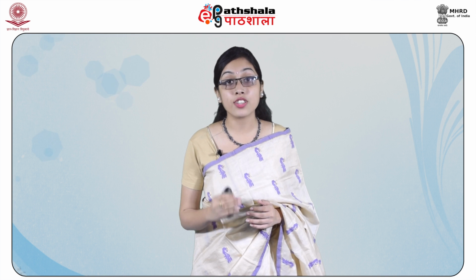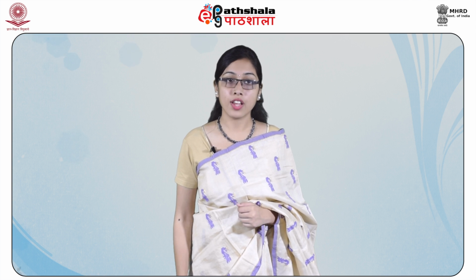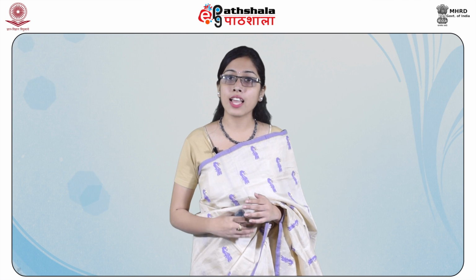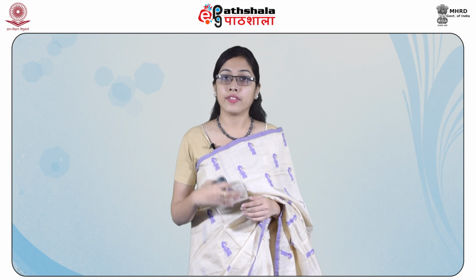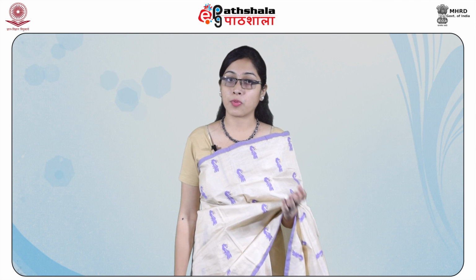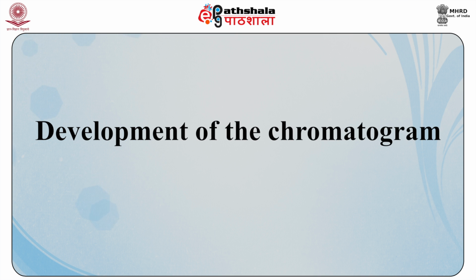A fine line is drawn on the filter paper so that it is a few centimeters away from the level of developing solvent. The dissolved samples are applied on spots of diameter about 6 to 10 millimeters that lie at least 3 centimeters apart on the line drawn on the chromatographic paper. The sample application is usually performed using micropipettes. The sample application may be repeated after solvent evaporates from the previous spots to concentrate the sample. The next step is the development of the chromatogram.